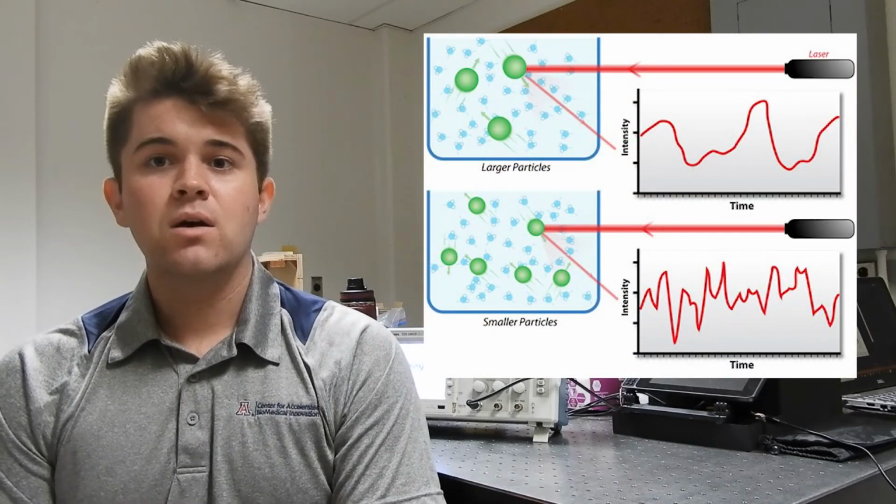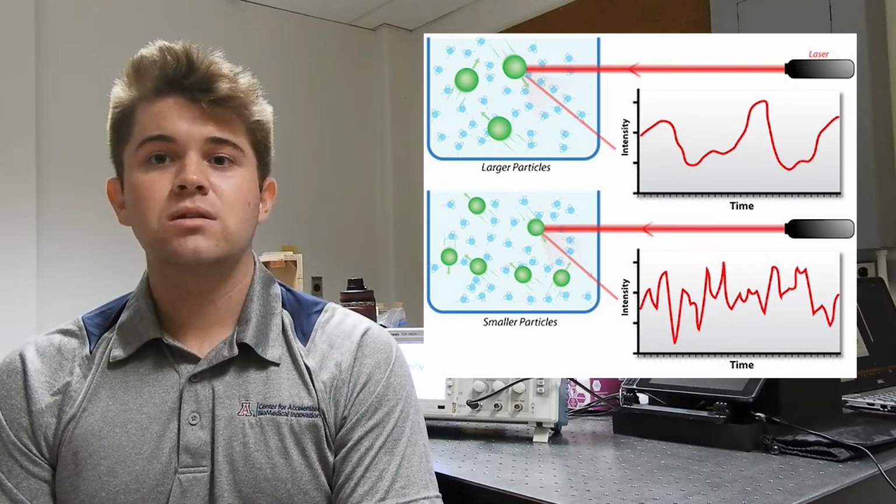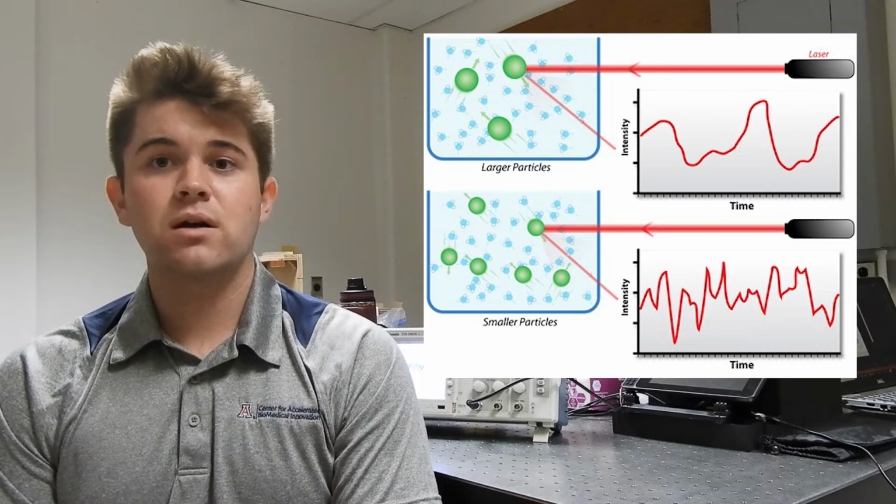We eventually were connected with Dr. McLeod, and he suggested using the method of dynamic light scattering, which is a technique that has been used to measure nanometer-sized particles in other applications. Since February, we have put in long hours in the optical lab space to collect data for our project, and we have been able to develop a system with this technique.